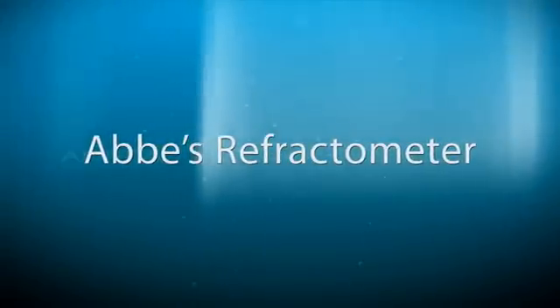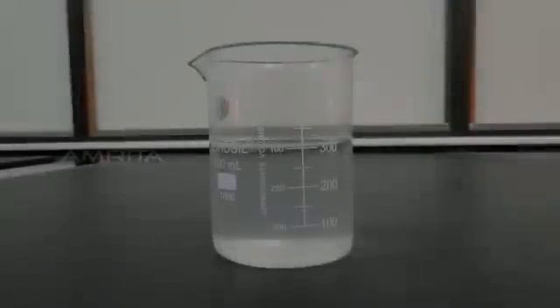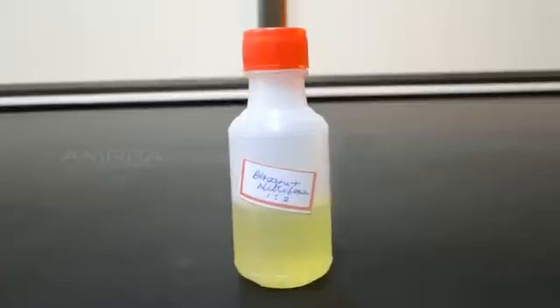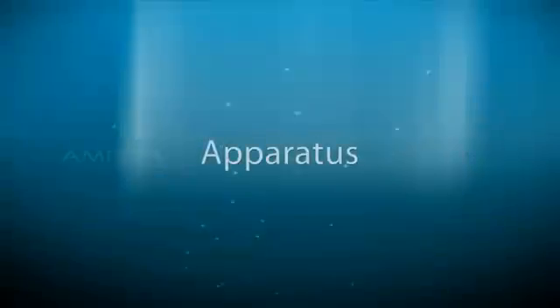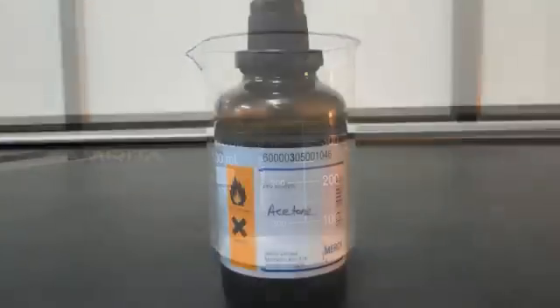Abbe's refractometer. Aim: to find the refractive index of the given liquid sample. Apparatus: Abbe's refractometer, cotton cloth, light source, and samples.